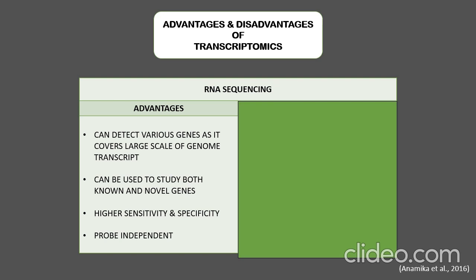And since we don't need any probe in this technique, it doesn't really matter if we know the sequence of a targeted mRNA prior to using this method. And this method has a pretty higher sensitivity and specificity compared to microarrays.